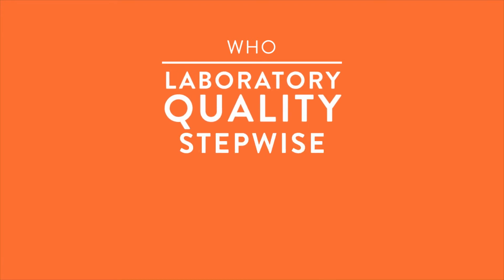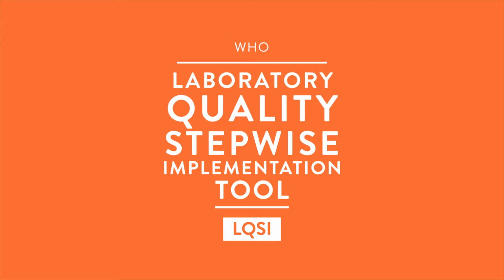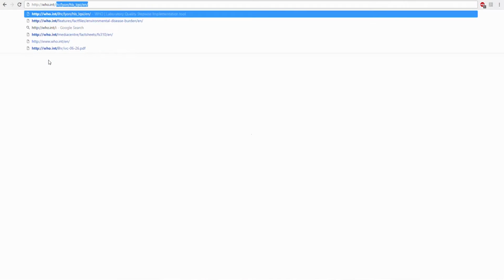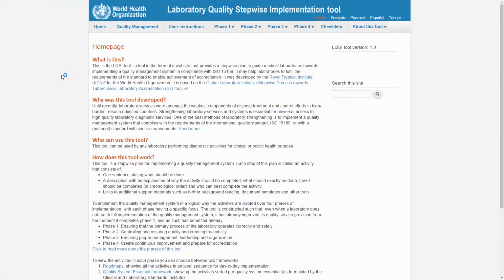In this video, we will take you through the World Health Organization Laboratory Quality Stepwise Implementation Tool, the WHO LQSI tool. We will do this step by step to show you how it works and what it can bring to improve quality in your laboratory. The LQSI tool is a guidance tool in the form of an easy-to-use website.